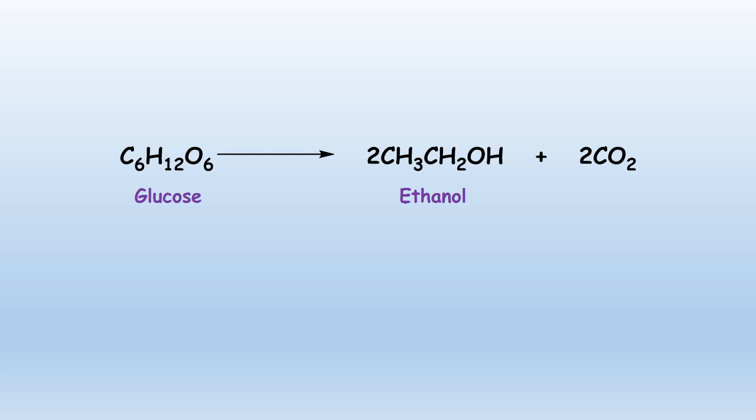The highest concentration of ethanol that you can achieve from this process, though, is around 15%, because at those concentrations, the yeast will actually start to die out. So we will then take the ethanol in the following week and try to concentrate that using distillation.